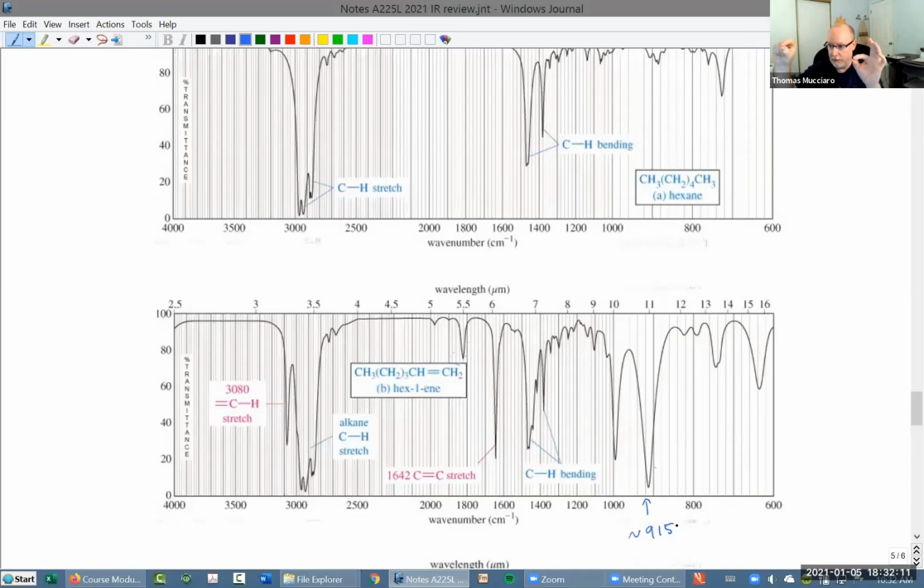That's at twice the frequency, and then there's one at 3 and so forth, okay? Those are called harmonics. The main thing about harmonics is that they are approximately whole number multiples of the original vibration. So if you look, here's 915, and look at here, do you see this? That's 2 times 915, it's a harmonic. I hope that makes sense.